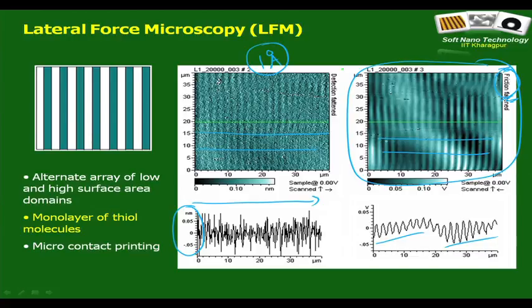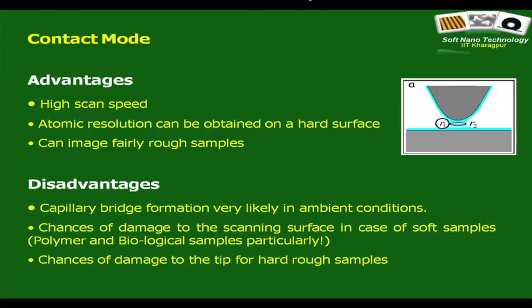So, this is what is known as one of the secondary imaging modes, but it is omnipresent whenever you are doing contact mode imaging. This is what is known as lateral force microscopy. So, we are now about to finish contact mode imaging.